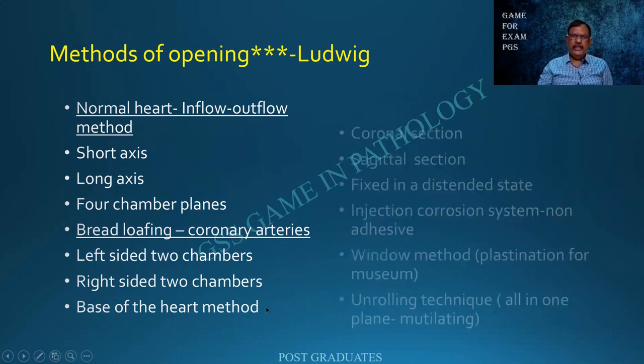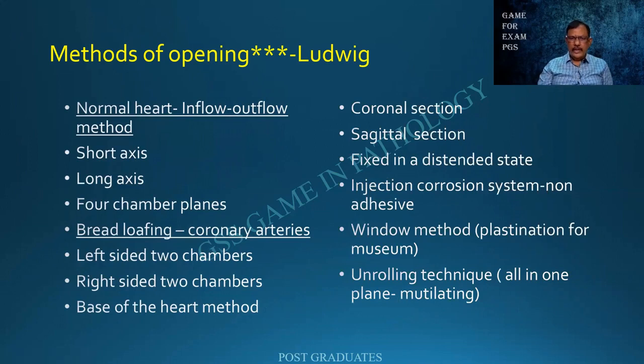If you are not happy with the list, see this also. So the entire list you people should be rattling off. And if your examiner asks, where did you read this from? You boldly say it is from Ludwig, Autopsy. And Ludwig himself says, in spite of this entire panel, these two things which I have underlined are logical. One is the inflow-outflow method described by Rudolf Virchow. And the second one is bread loafing for finding out any obstruction in the coronary artery. All the other methods you people will have to learn by heart beyond my explanation.